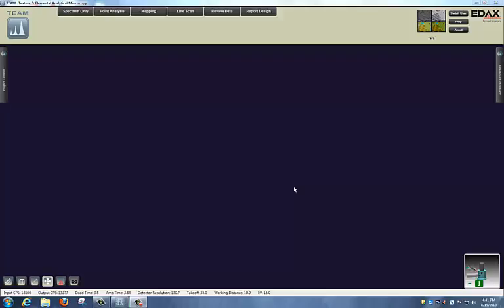In this software movie, we'll review the activity bar that's located at the top of the EDAX Team EDS software. The activity bar is going to be the basis for all data acquisition from the software. Specifically, we'll review the Spectrum Only tab and the Point Analysis tab.